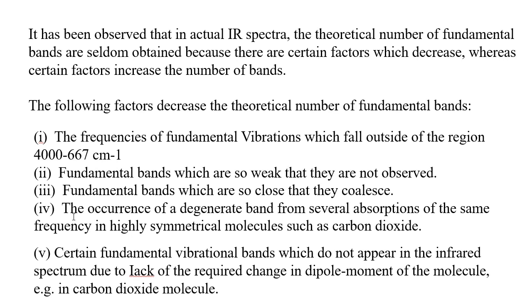Another factor is the occurrence of degenerate bands from several absorptions of the same frequency in highly symmetrical molecules such as carbon dioxide. It is important.